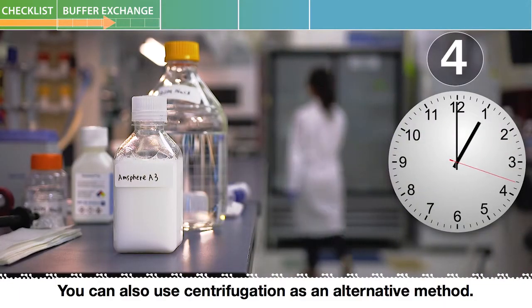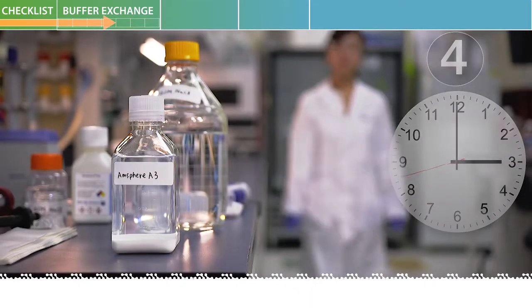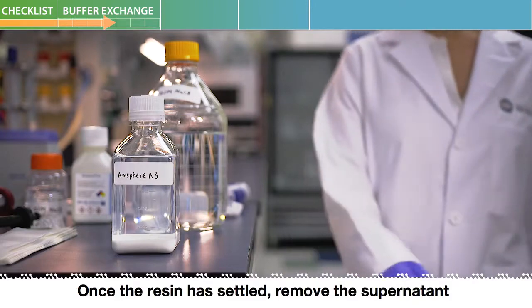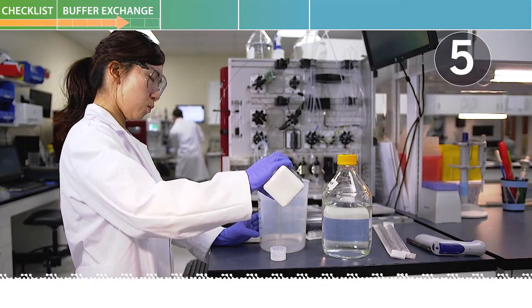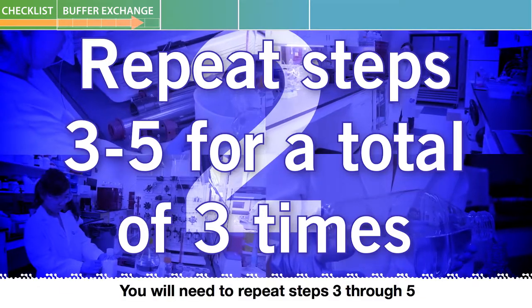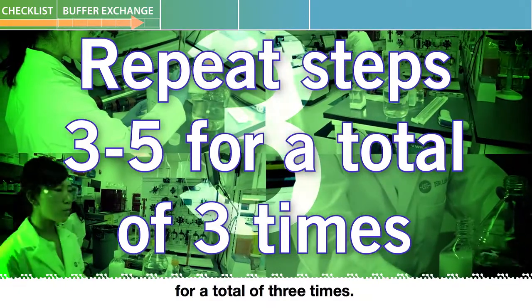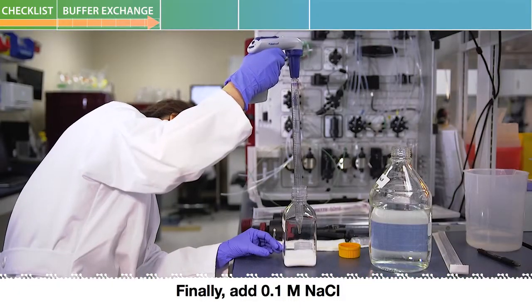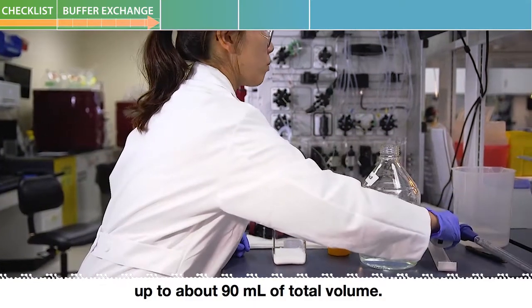You can also use centrifugation as an alternative method. Once the resin is settled, remove the supernatant by decantation. You will need to repeat steps three through five for a total of three times. Finally, add 0.1 molar sodium chloride up to about 90 milliliters of total volume.